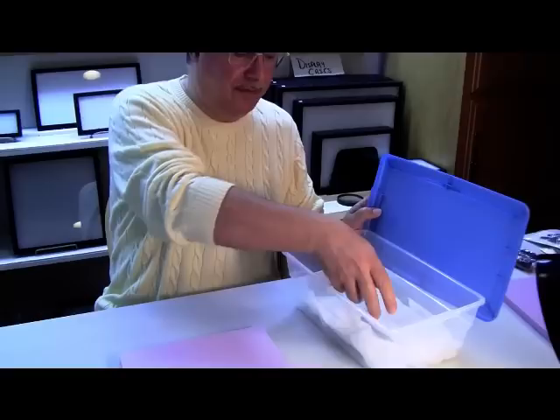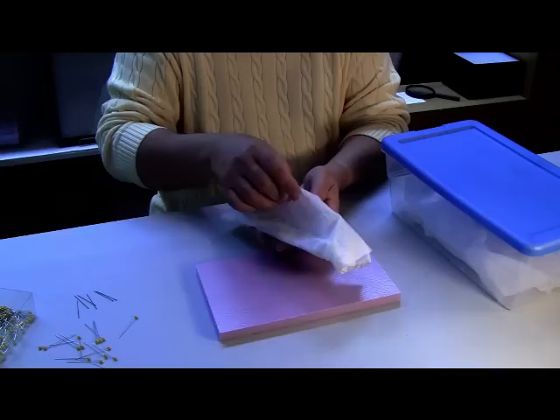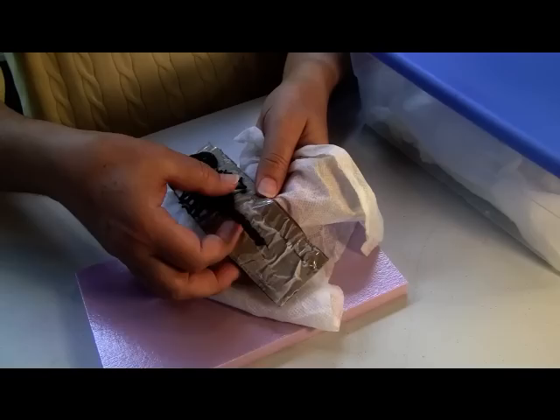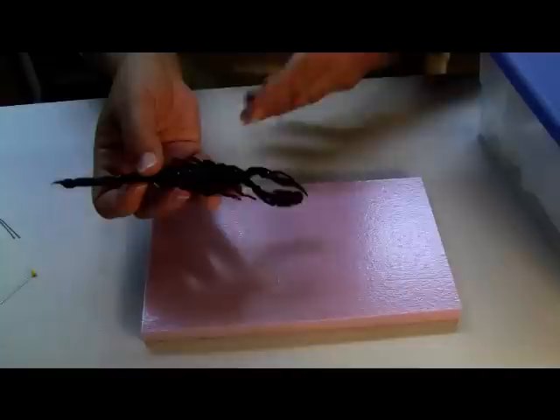After 24 to 48 hours of rehydrating, you're going to take your scorpion out of your shoebox. He's still wrapped in wet paper towel. We're going to unwrap him, and you'll see here he is — a very large specimen. We've taken the plastic off of him and set that aside.